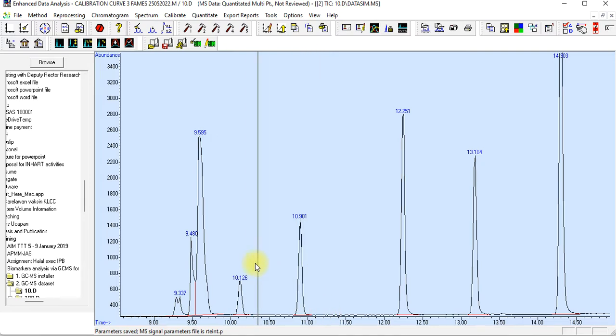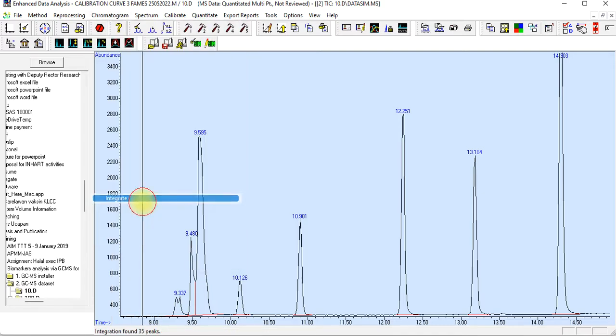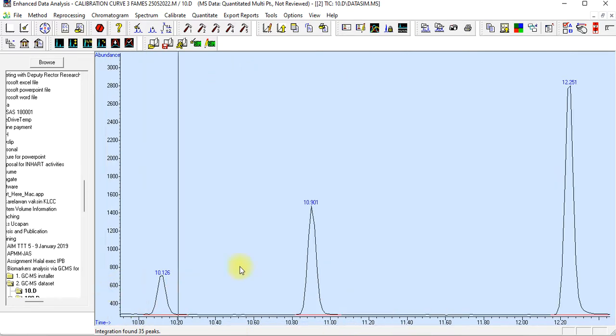Okay. So if you refer previously, when we click chromatogram and integrate, the compound that we want, C6, C8 and 10 are these three. Kita nak ni these three compound. But only 2 are integrated. This one not yet previously.